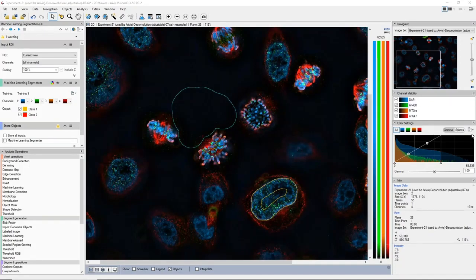If I don't have much space on my hard disk, is it possible to save files on OneDrive? I really wouldn't recommend it. One of the reasons why it's important to have space on your hard disk is because Vision 4D makes very extensive use of just-in-time loading. That means we load into memory only those pixels that you need as and when you need them. So what I'd recommend is that you offload to OneDrive any of the data that doesn't need to be on your hard disk right now, and then make space for your temporary documents and everything else on your hard disk.